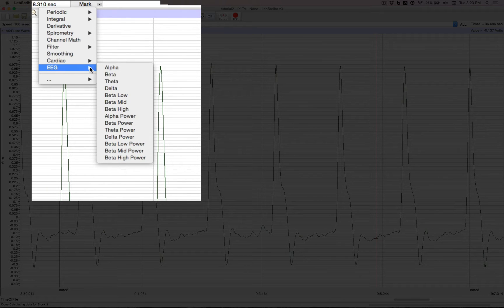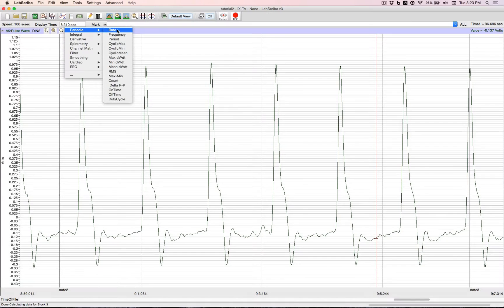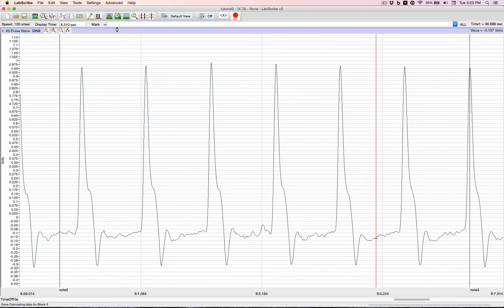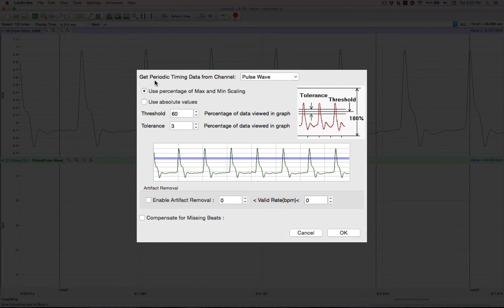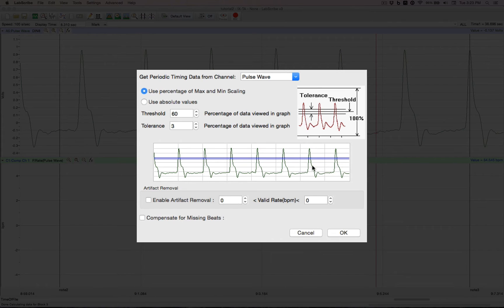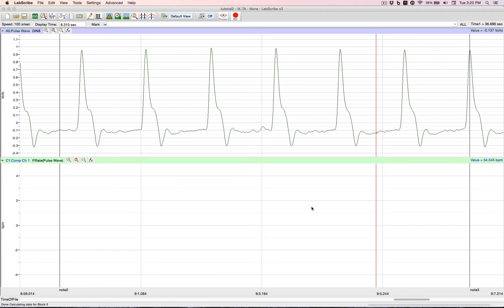Let's do a periodic rate. Click on it. Brings up a dialog box. And we have a threshold line, which is set up ready to go. We click OK. And there's the rate on the bottom channel.